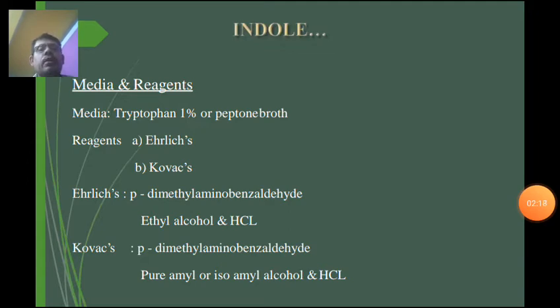One reagent is Ehrlich's reagent, another is Kovacs reagent. Ehrlich's reagent contains para-dimethylaminobenzaldehyde, ethyl alcohol and hydrochloric acid. Kovacs reagent also uses para-dimethylaminobenzaldehyde, with pure amyl and isoamyl alcohol and HCl.